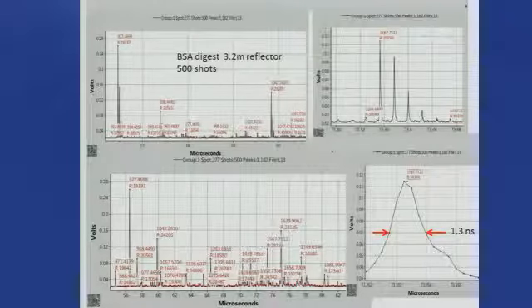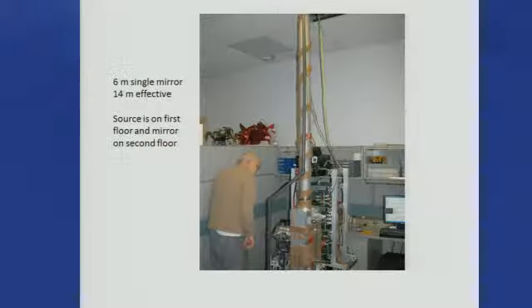And I say you can buy this from a number of vendors now, something of this sort, and it is now routine, and the sensitivities are quite good, and so for high resolution and reasonably high mass accuracy.